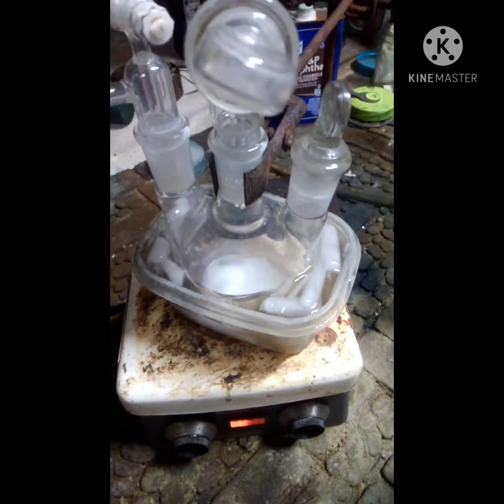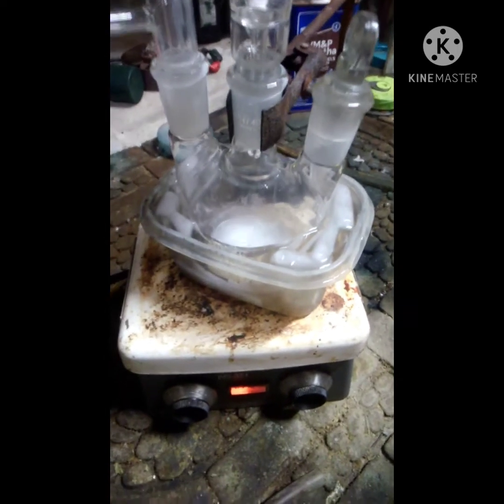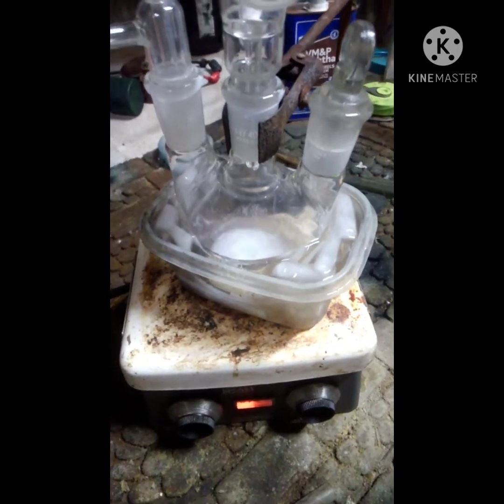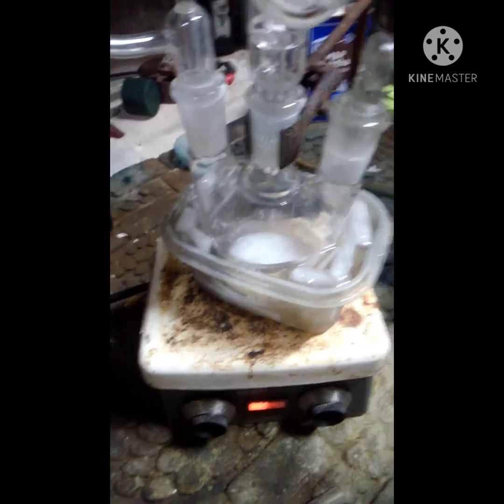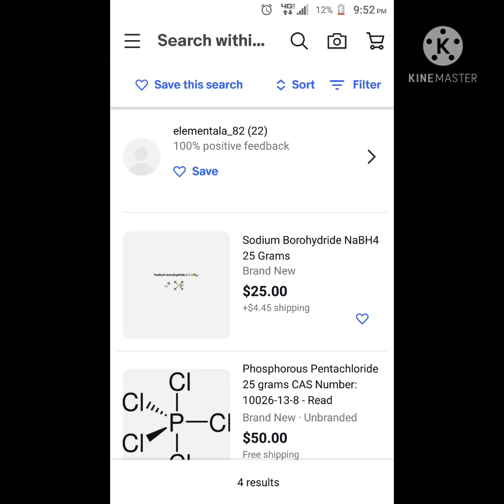This is going to drop down in there, and then I'm going to let this stir until the hydrogen stops bubbling. At that point I'll probably let it stir for a couple of extra minutes just to make sure it's all done, and then I'll be back.